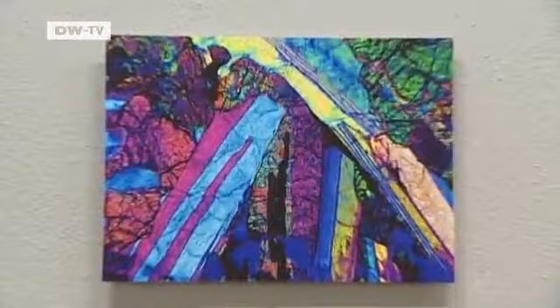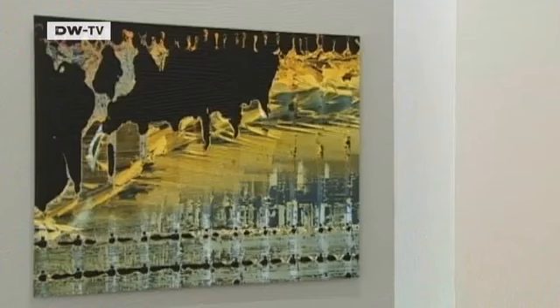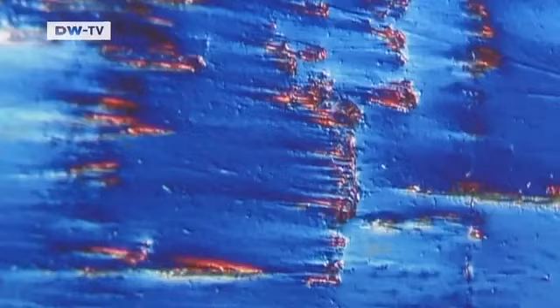The beauty of science. These magnesium sulfate structures are seen here magnified a thousandfold. This is a cross-section of genuine moon rock. Turning the ordinary into something extraordinary, fragments of an LCD monitor become art under the microscope. Like this metal surface on show as part of a retrospective of the work of microphotographer Manfred Kage.